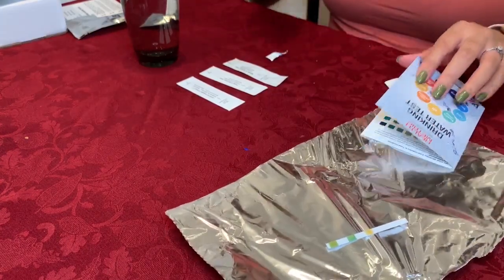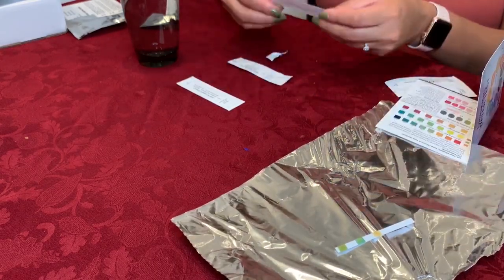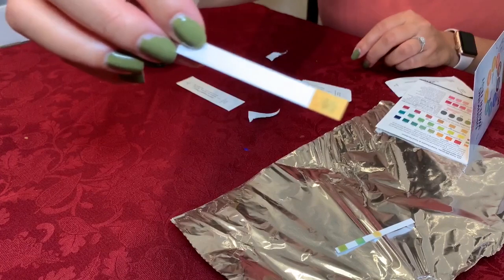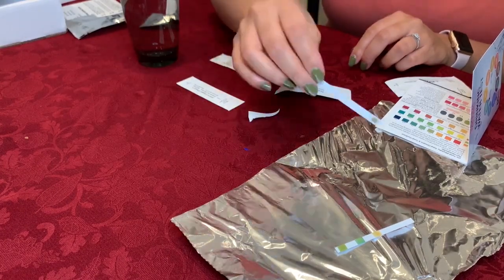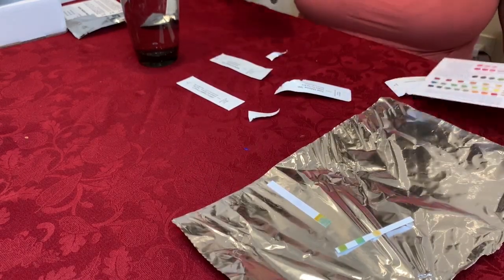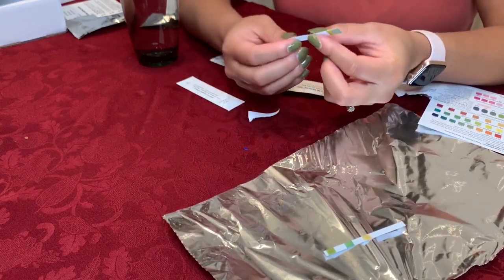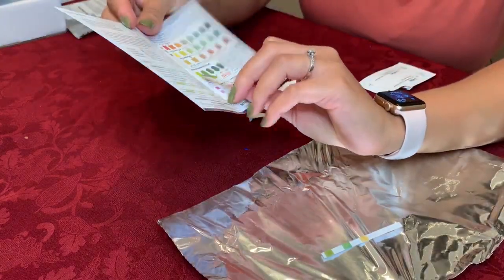The next test is the total chlorine. Take the test strip out — looks like this. Dip in the water for five seconds. Now I just have to wait 30 seconds. Looks like it's been 30 seconds. Now all I have to do is fold it. Next, I just compare it to total chlorine.